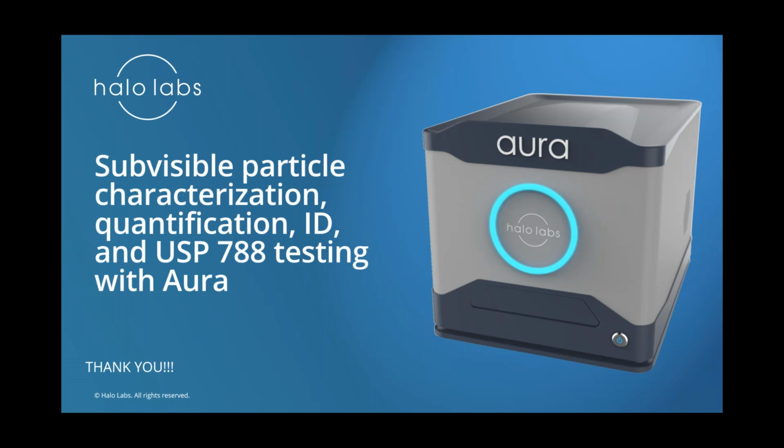Another question is, do we know if there's a viscosity cutoff for the membrane filtration step? I think we have it set at 50 cP, but from a more practical perspective, we have customers working with formulations with concentrations up to 200 mg per mL, highly viscous samples. If you have any interest in that, we'd be more than happy to help. We have a tech note that we put out maybe a month or 2 months ago that talks about some of the suggested workflows for dealing with highly concentrated protein samples. Great, and that's available for download on our website.